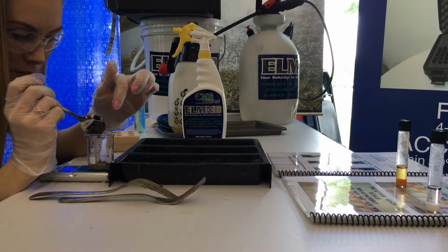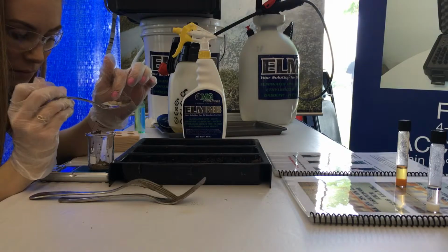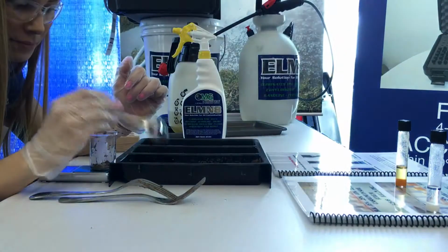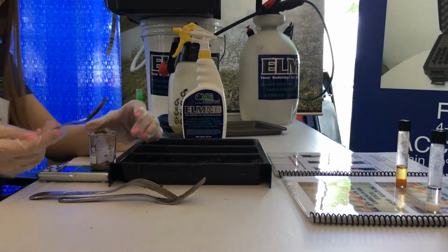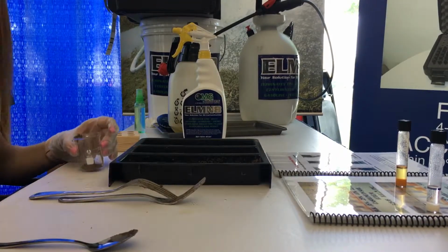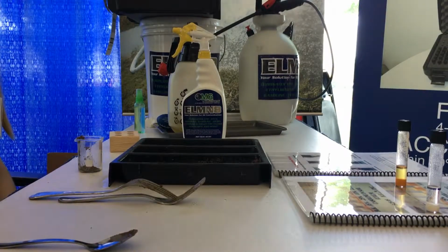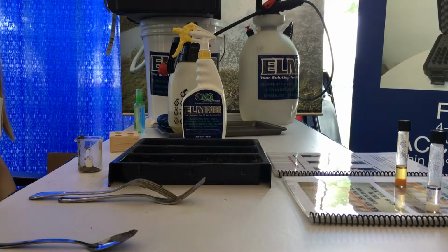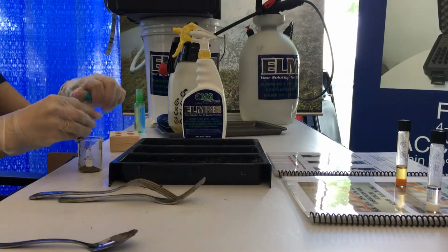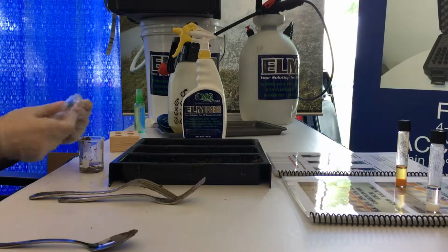Also, sometimes when you're using dry soil, when you do your extract and you pour it over in the test tube, some soil particulates will come over. It's not going to affect your chemistry whatsoever. All right, add our extract solvent. It's tough. He has a tool that's a socket rig, and you turn the socket.